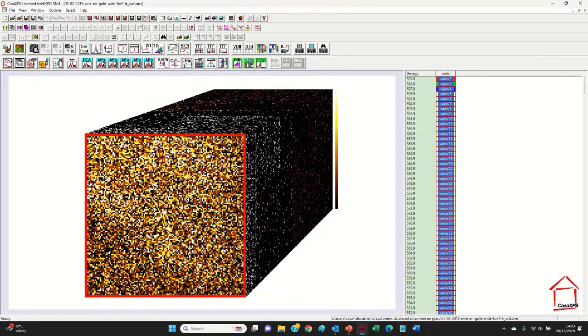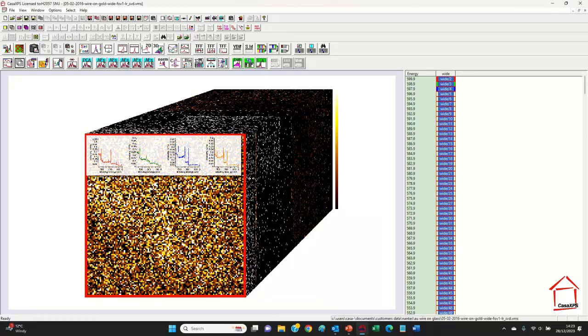If we can identify a set of pixels that have some commonality in terms of chemical state or chemistry, then we ought to be able to pull out a spectrum that corresponds to a precise zone on the image, and therefore we can identify spectra that come from different places that do not have chemistry in common, but they have specific chemistry that we would like to understand.